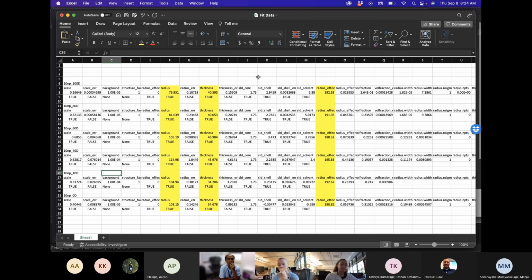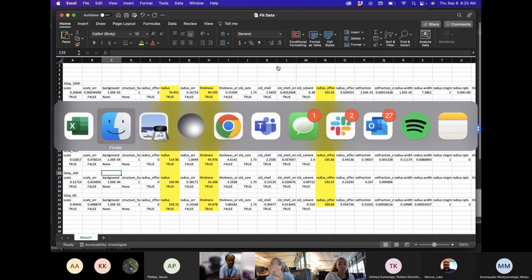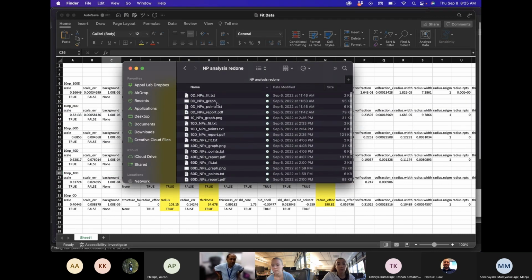So one thing to think about: PEG should be outside, I guess. But maybe you're not seeing something, and as you change the contrast, you're not seeing the entire particle, and so the shape changes. But overall, you still have a shell thickness of close to 35 to 40 angstroms all the time. It's confusing. I need to remind myself about your system again.